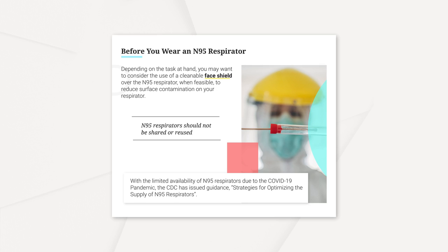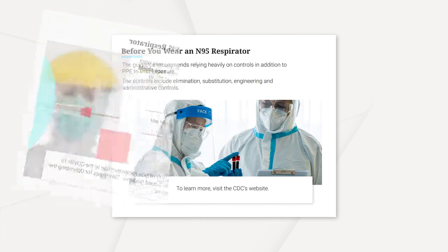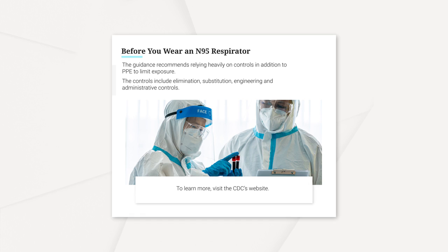With limited availability of N95 respirators due to the COVID-19 pandemic, the CDC has issued guidance, strategies for optimizing the supply of N95 respirators. The guidance recommends relying heavily on controls in addition to PPE to limit exposure. The controls include elimination, substitution, engineering, and administrative controls. To learn more, visit the CDC's website.